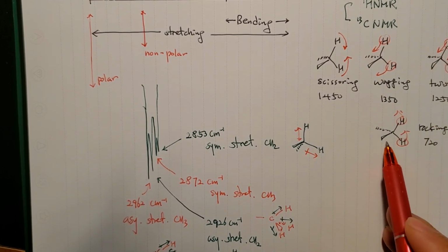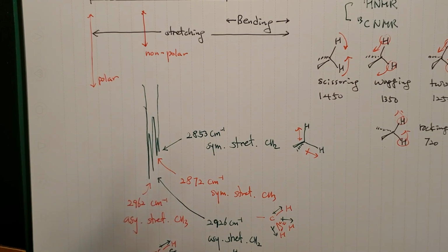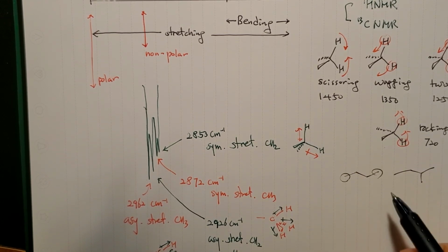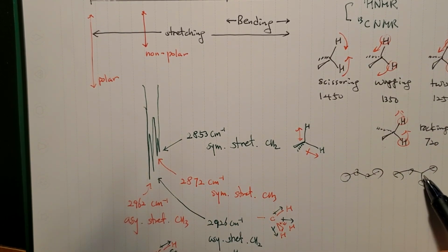They are moving away from these electrons. At the same time, they are coming to this. So it's not that difficult. When you have a structure like this or this, you have methyl groups and methylene groups. So you expect all of these with this additional peak, right? And the intensity for methyl-related peaks will increase as you have more concentration, more methyl groups.